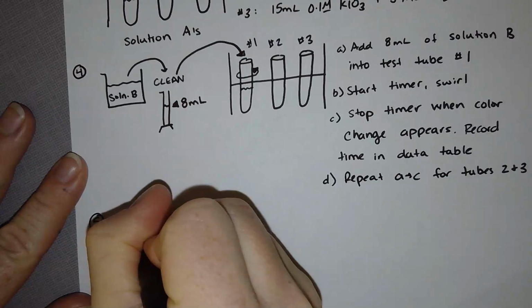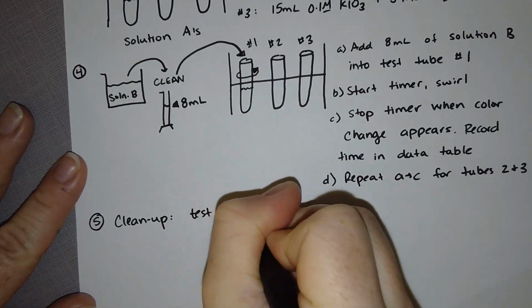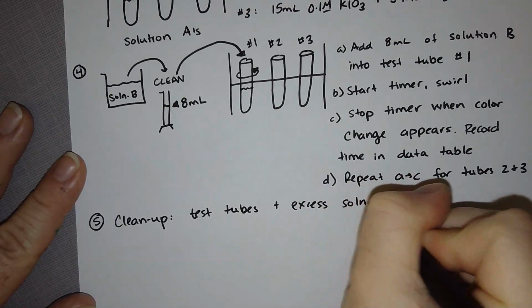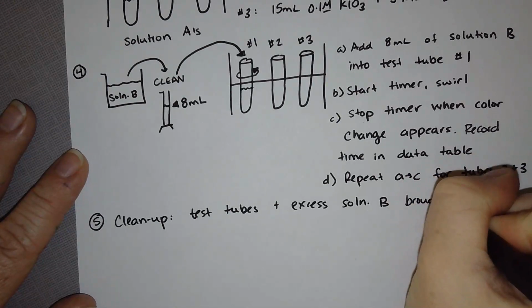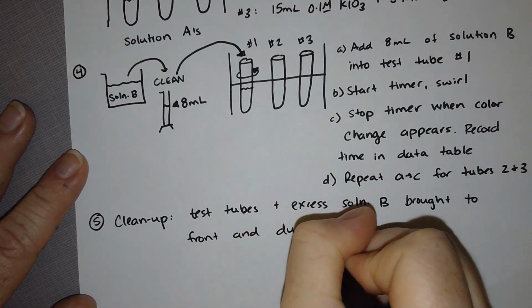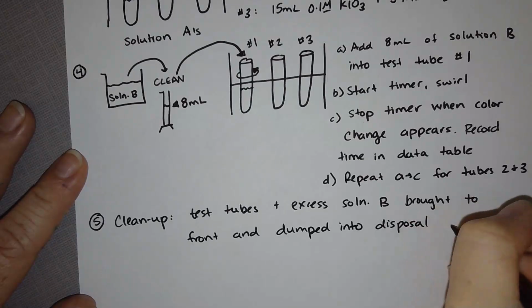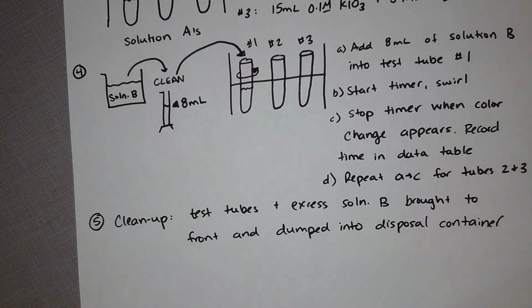So for our cleanup, your test tubes plus excess solution B are going to be brought to the front and dumped into the disposal container. And they go into the same container. Okay? So, very straightforward lab.